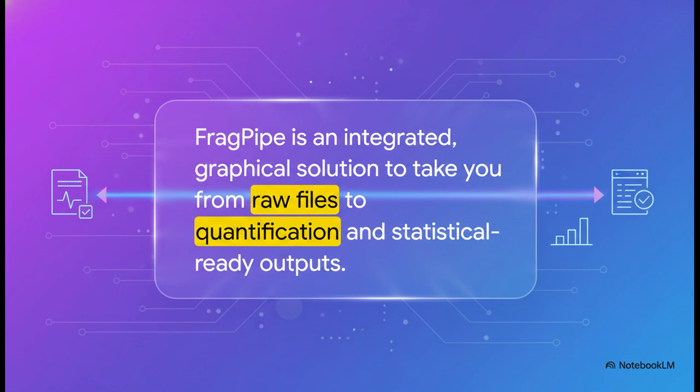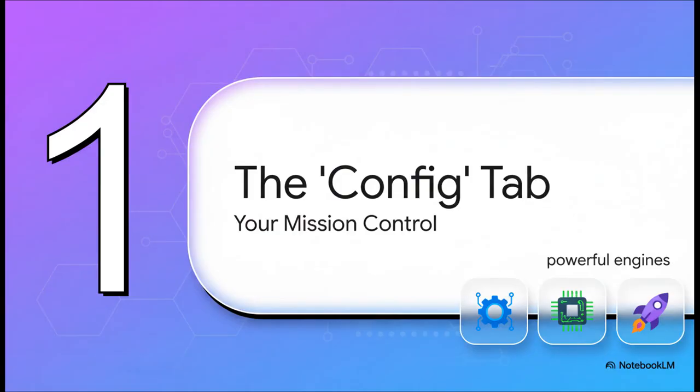FragPipe is an all-in-one platform with a graphical interface that's designed to walk you through that whole journey, from the moment you load your raw files to the second you get those beautiful outputs ready for analysis. Okay, let's jump right in.